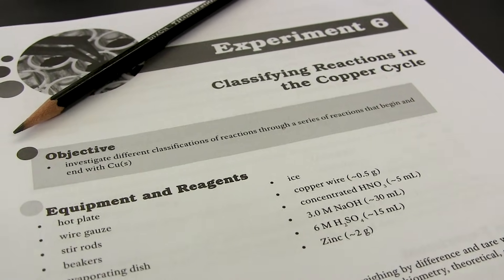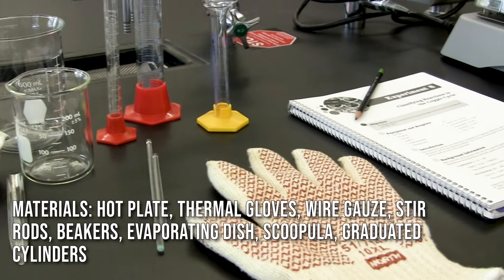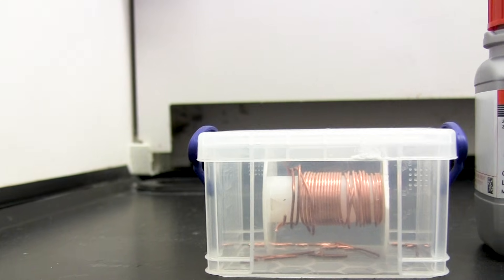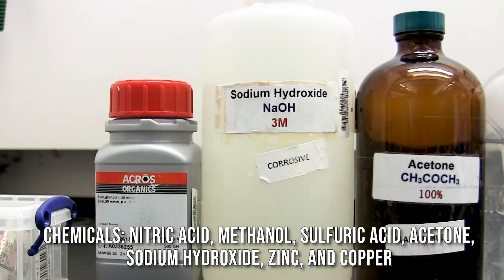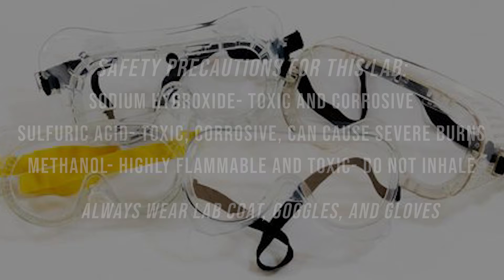Welcome, guys. Today we will be exploring the copper cycle reactions in the lab. We've got some pretty standard materials that you would find in any lab, and we will be using some nitric acid, methanol, sulfuric acid, acetone, sodium hydroxide, zinc, and copper metal.